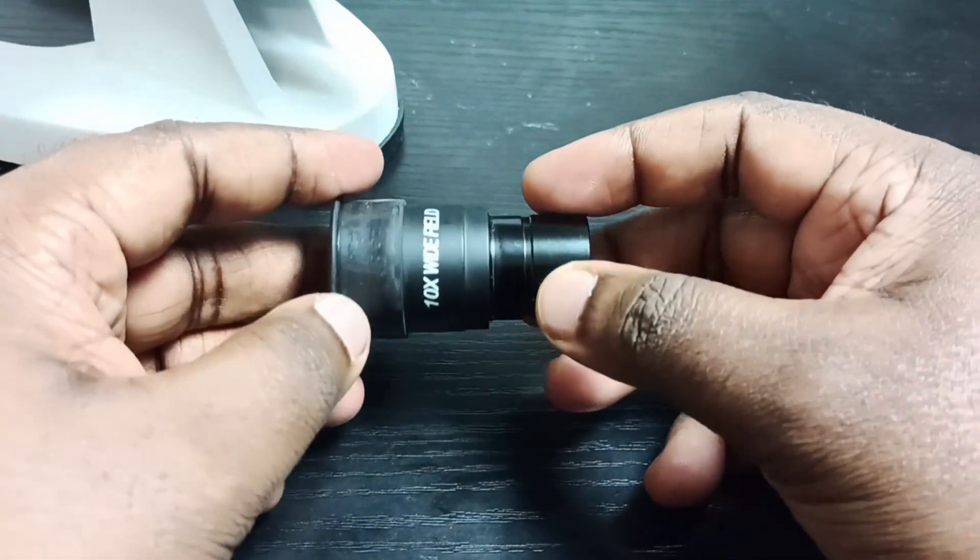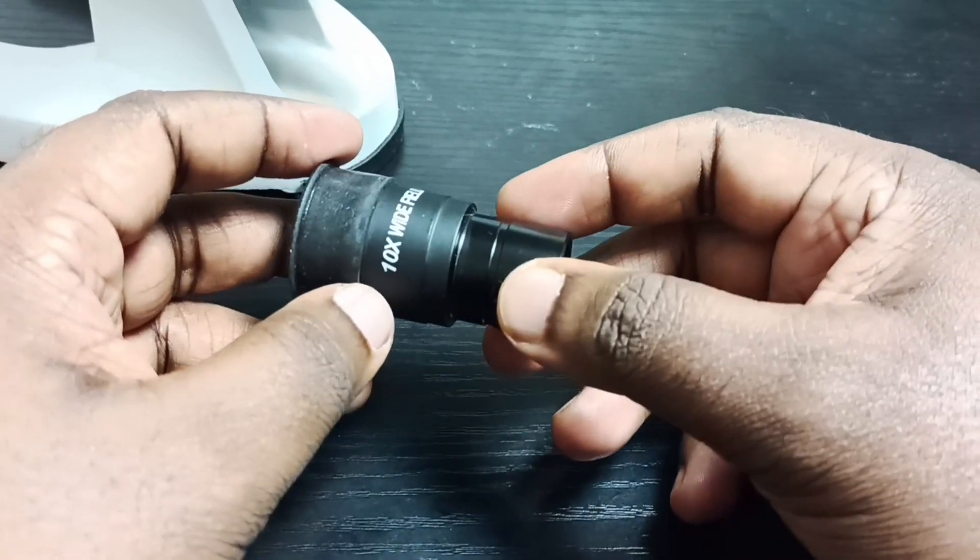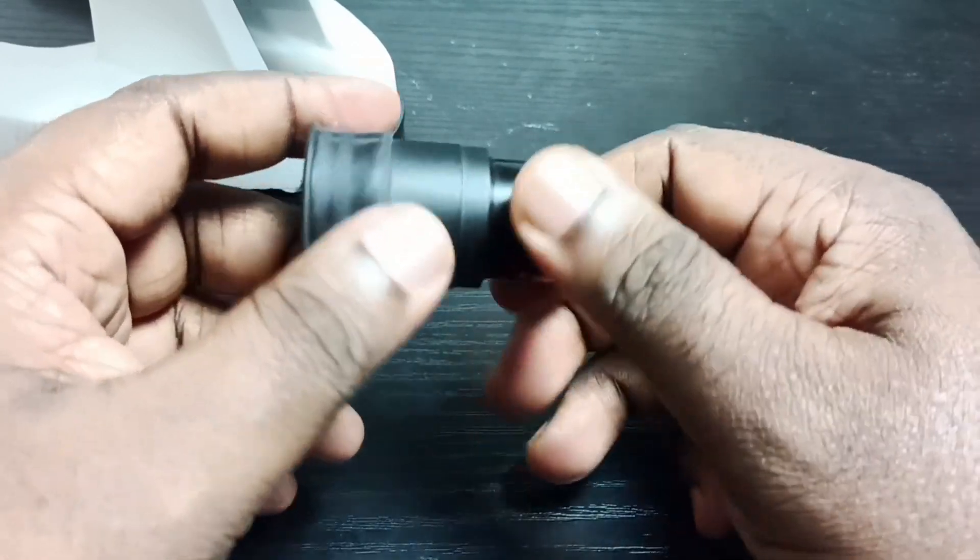So this way we can open the eyepiece lens, clean it, and then put all the parts back. I hope you enjoyed this video — please check it out.